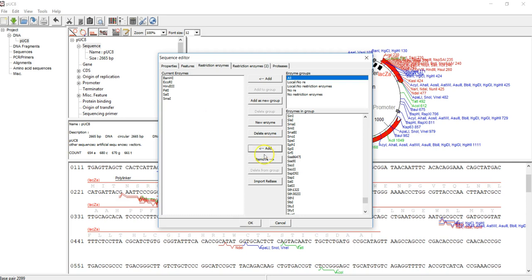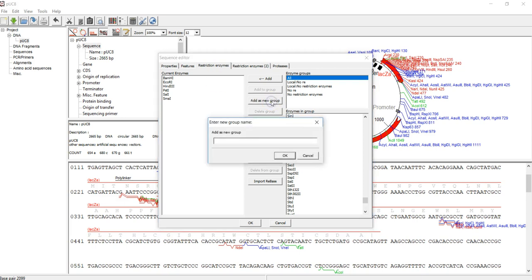All these restriction enzymes are coming from different bacteria. That's why they are named in such a way. Now these are the list of restriction enzymes within the polylinker region that I want to use, so I'm going to add this one as a new group. After that, I give it a name. For example, this is a pUC8 group, or you can name it using the acronym of each of the enzymes so it'll help you to find it very quickly.